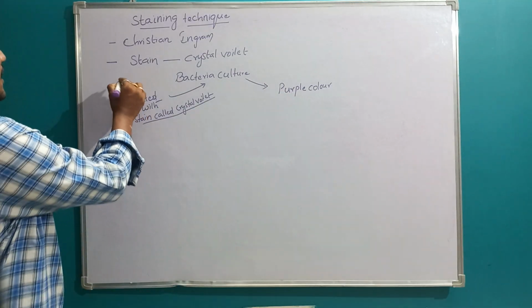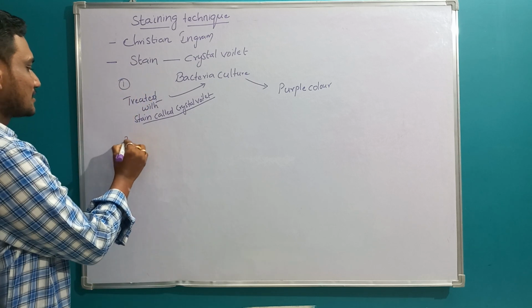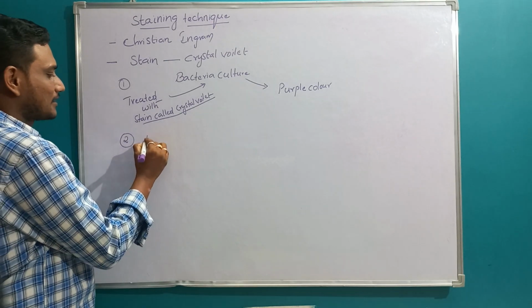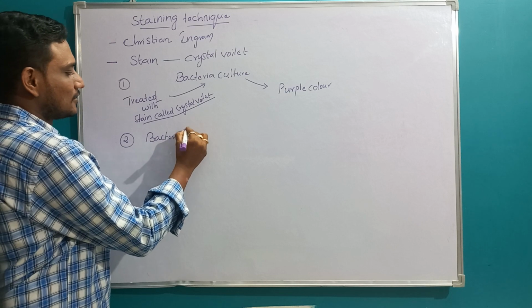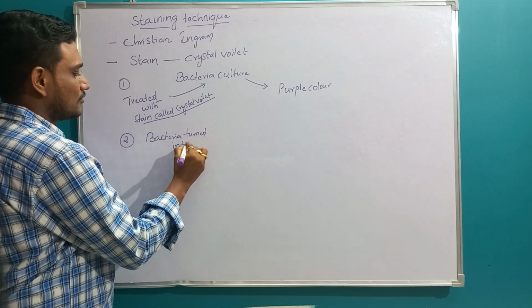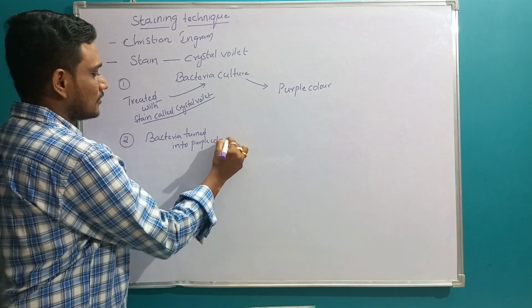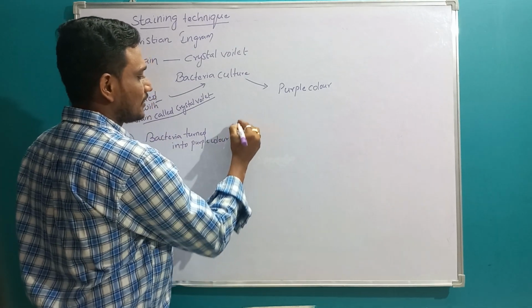This is the first step. In the second step, the bacteria that turned purple get fixed.